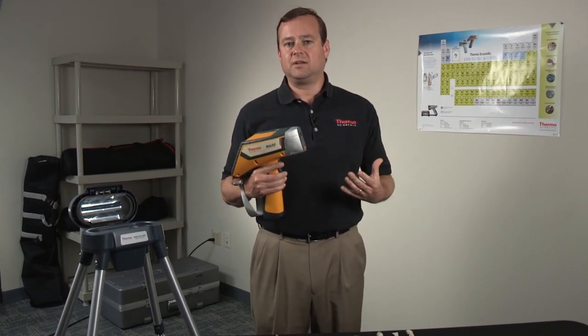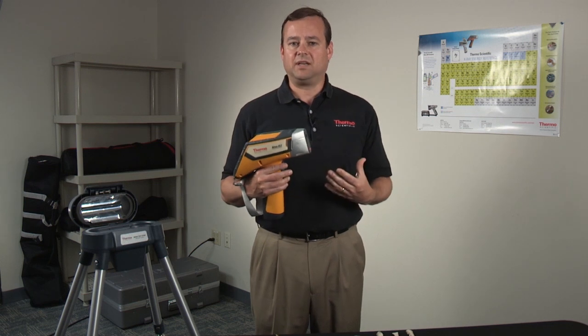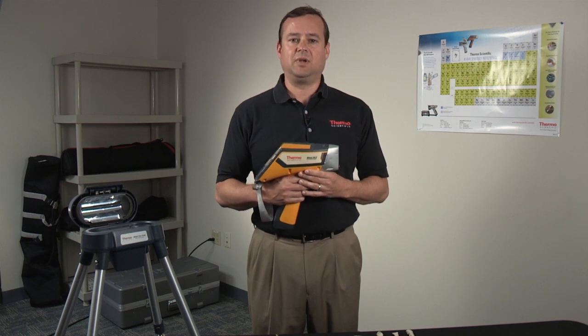Now one of the big questions in the industry, particularly when using XRF analyzers, is how do you know that it's plated? Because heavily plated material can give you false XRF readings. So how do we deal with that?